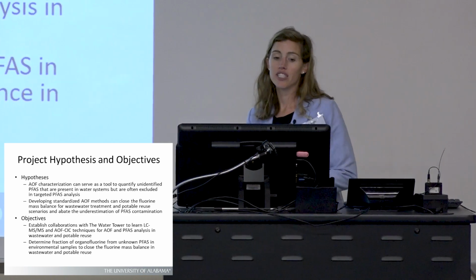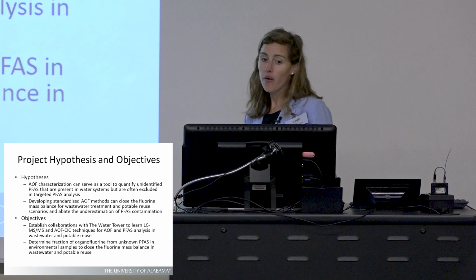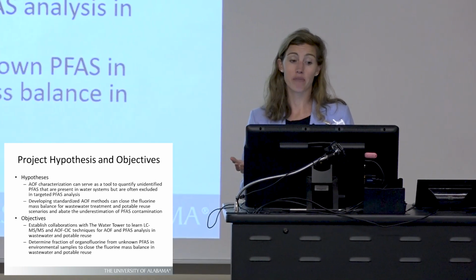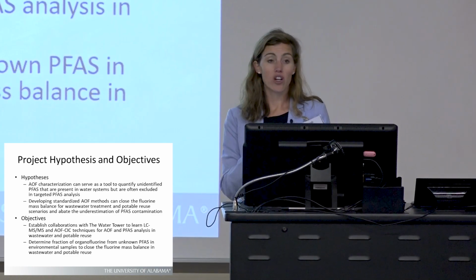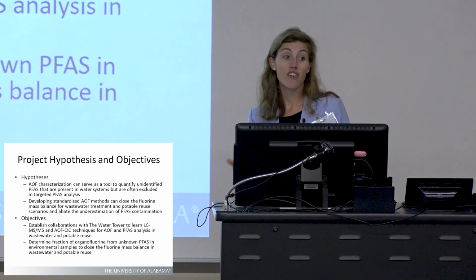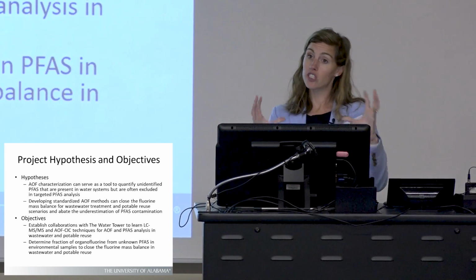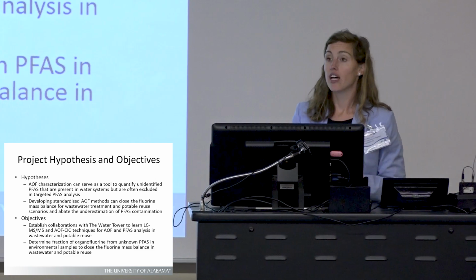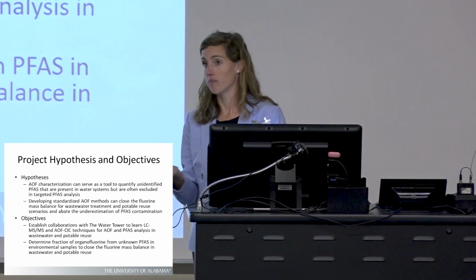So the hypothesis for this project and the objectives: we hypothesize that AOF can serve as a tool to help quantify this unidentified PFAS present in water systems, but they're often excluded when we look at targeted PFAS analytes. And then we want to look at developing a standardized AOF method that can help close this fluorine mass balance for wastewater and water reuse scenarios to help abate that underestimation of PFAS contamination.